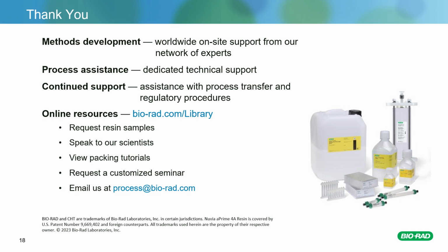Also, you can find there the actual contour plot, which is, in my opinion, a good visualization, and it's nice to see what conditions are optimal with regards to virus clearance.